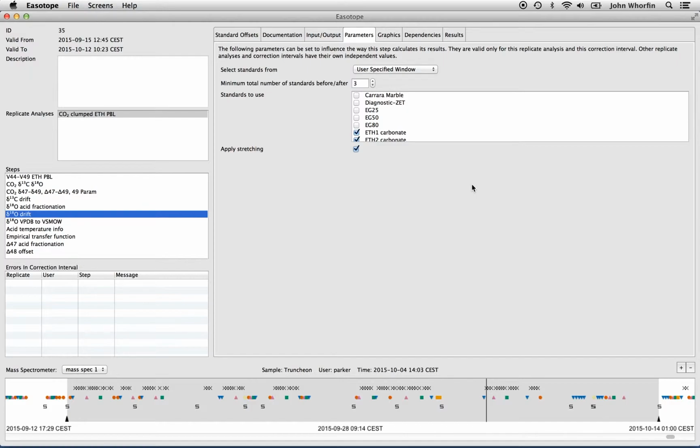And in fact, I recommend that only 1 or 2 trusted lab people have permission to modify the parameters. Other users can look at the parameters and make suggestions if they want, but your best people should probably be assigned to setting parameters like this.